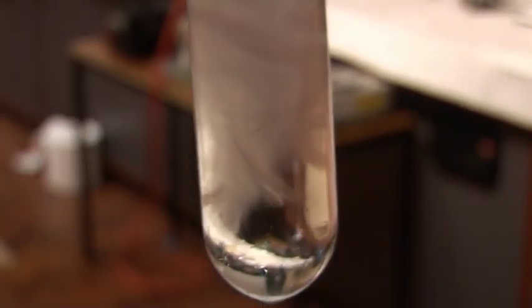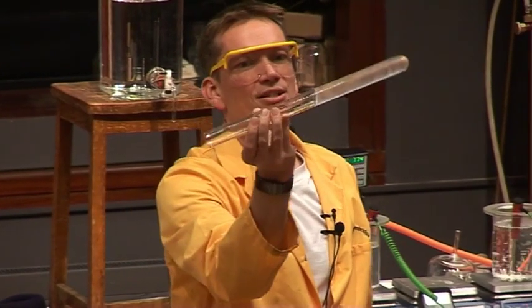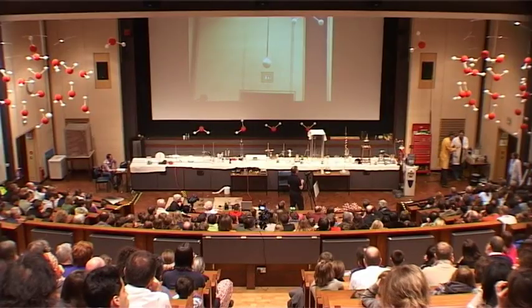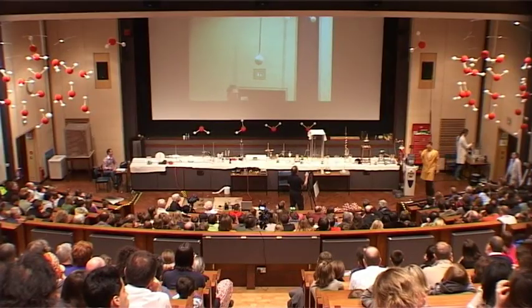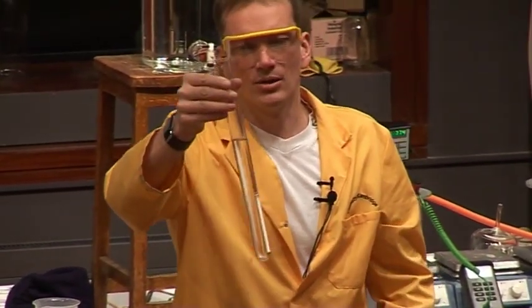And this is because the water should be ice at temperatures lower than 0. Okay, and now it is ice. There's a little bit of water left, but it's ice. But if we're very careful and use a very clean tube, if we can have another one then, please, thank you. So using a very clean tube and very pure water and cooling it down very, very slowly, well, it can still stay as water.